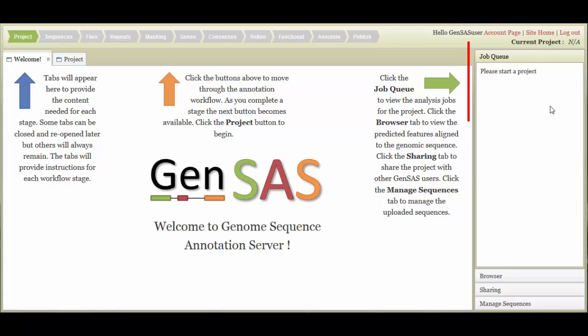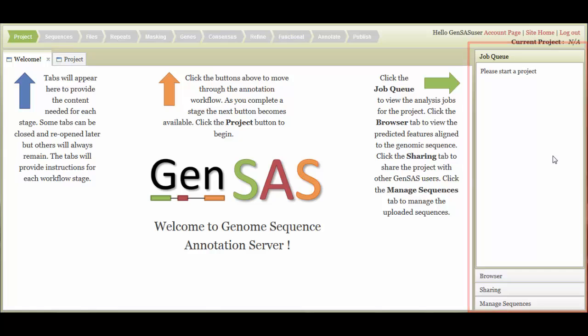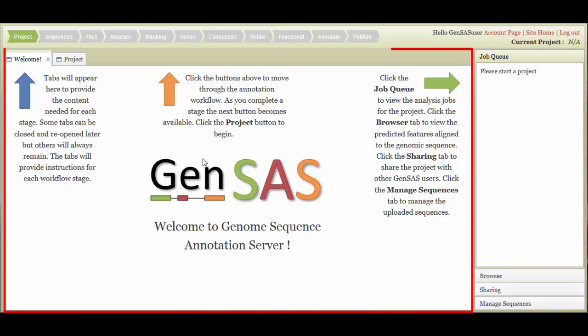On the right side is an accordion menu that lets you view the job queue, open the integrated WebApollo and JBrowse, share your project, and manage uploaded DNA sequences. The last area is the tab region, and this is the main work area for annotating with GenSaaS.